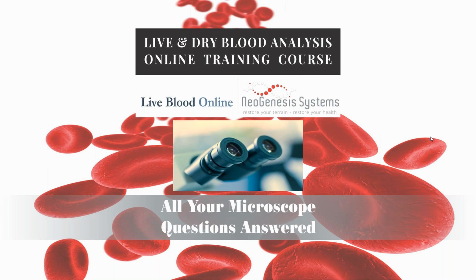Phase contrast became popular because it's less costly in terms of the build of the microscope. You don't require as strong a light source for phase contrast, and it allows you to see some of the anomalies that you'll see in Darkfield and some of the anomalies that you'll see in Brightfield, but it certainly doesn't allow you to see everything that you'll see with a good Brightfield and Darkfield system. So there's not really any additional benefit of doing phase contrast, but it is, as I said, available. We can add it onto the system.